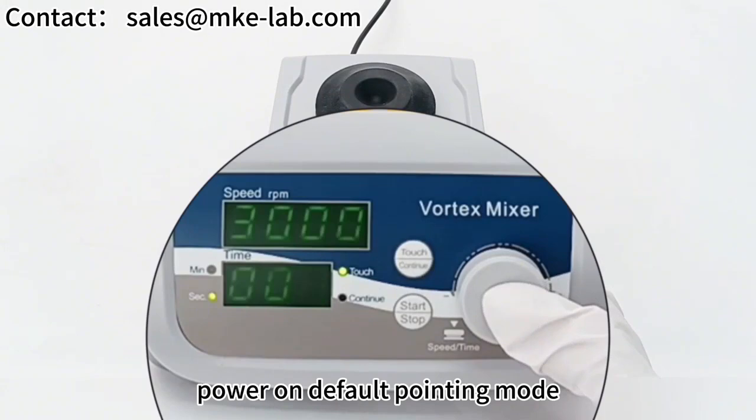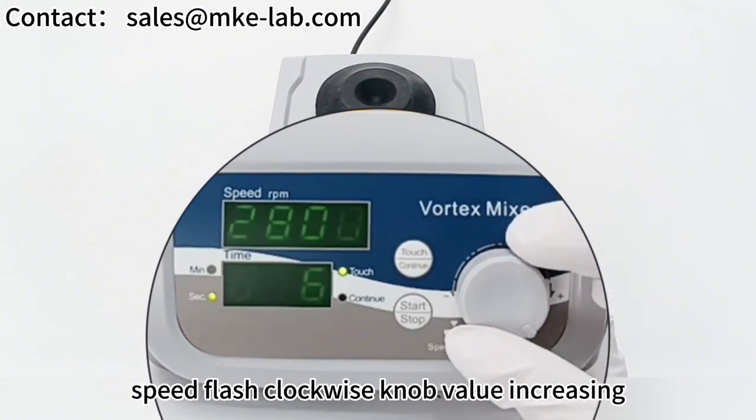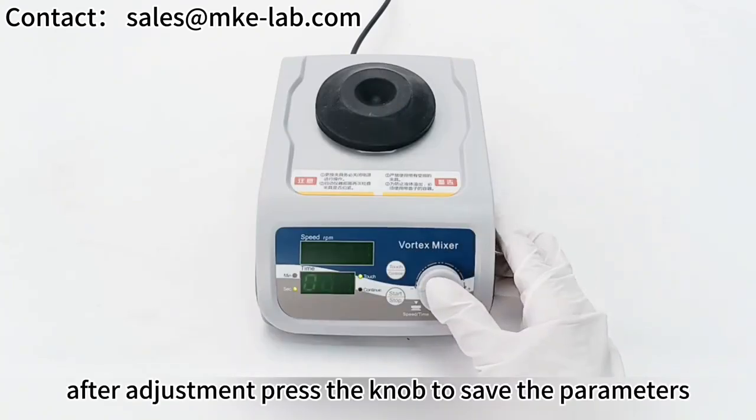On power-on, the default is pointing mode. Press the white knob — the speed display flashes. Turn the knob clockwise to increase the value, counterclockwise to decrease it. After adjustment, press the knob to save the parameters.